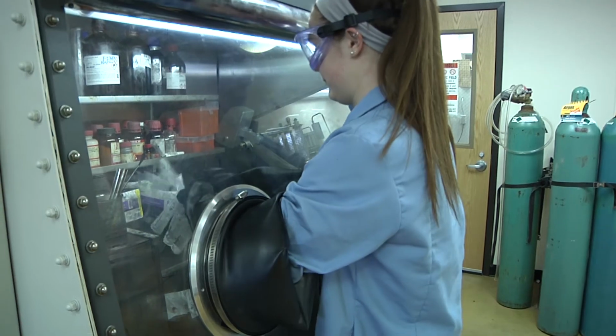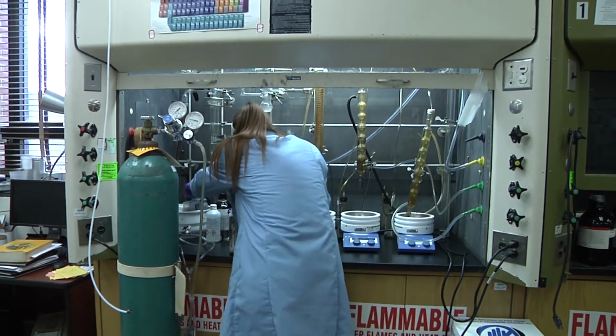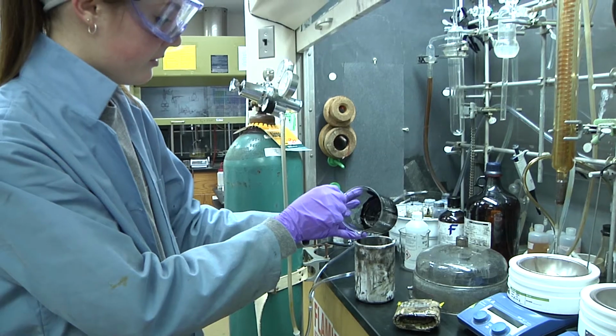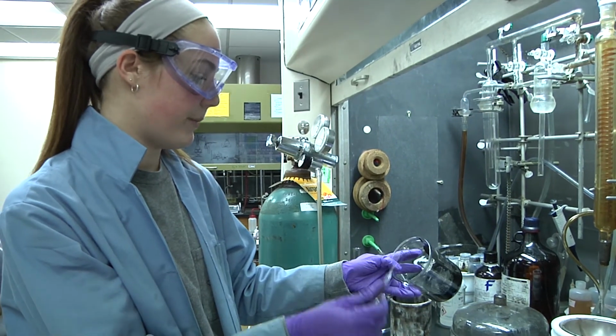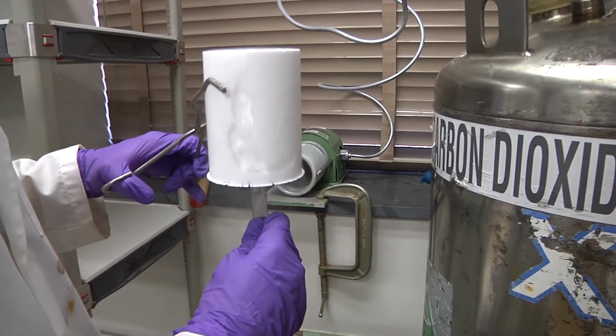My project is the synthesis of air-stable, gold-coated, iron and cobalt nanoparticle-based ferrofluid, which in short is just liquid magnets. I want to coat it with gold, the smallest particles, so that it can be used for magnetic drug targeting. Specifically, I synthesize nanoclusters for breast cancer research.